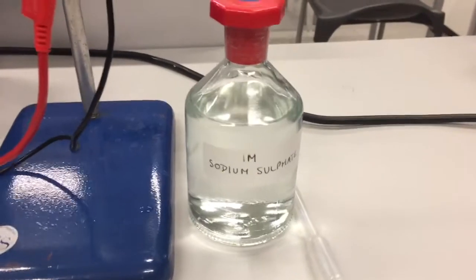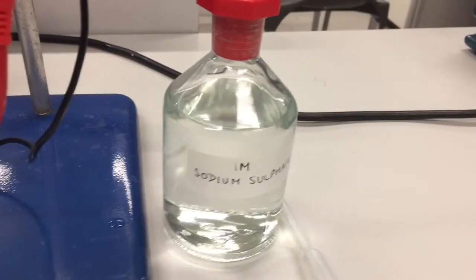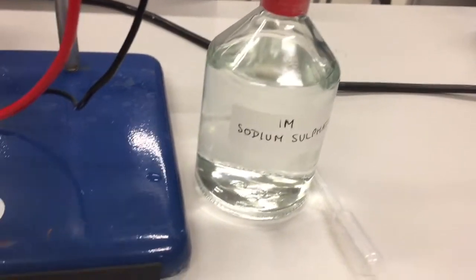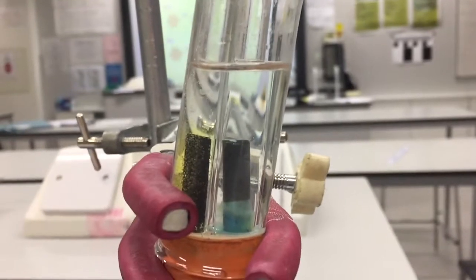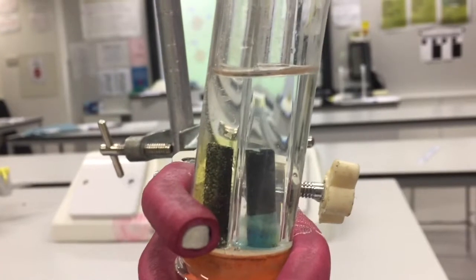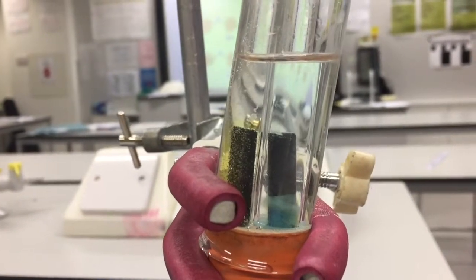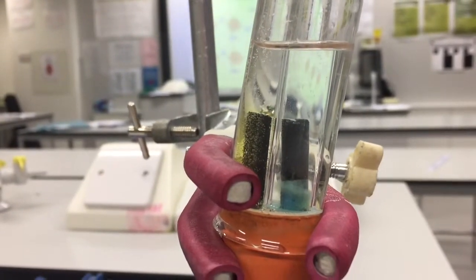So that's that one. And again, we've got the light just to show it working. And our final one, the most complex one, sodium sulfate. So sodium is more reactive than hydrogen, and sulfate is not a halogen. So what do we get in the case of this one? First of all, at the positive electrode, the anode, we're getting a gas produced. And that gas that's being produced there is going to be oxygen.